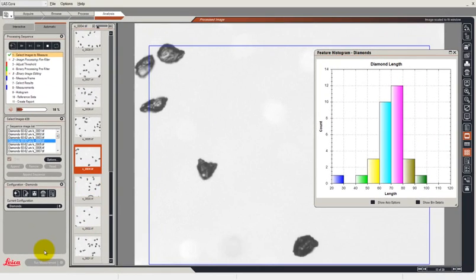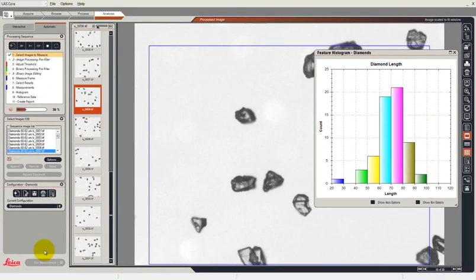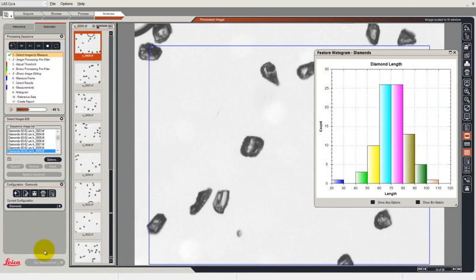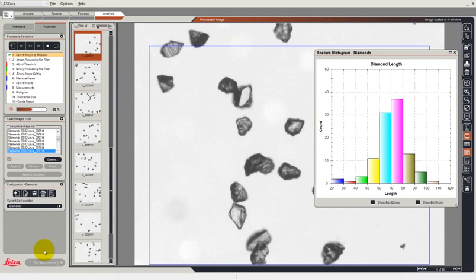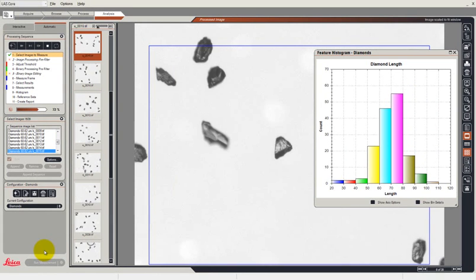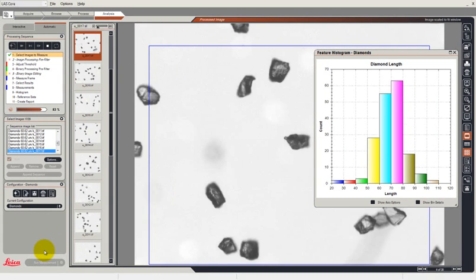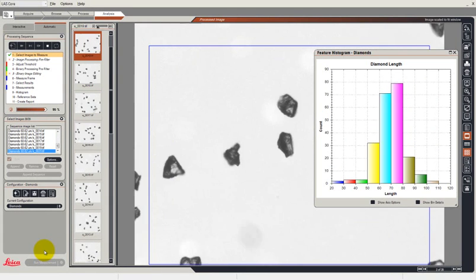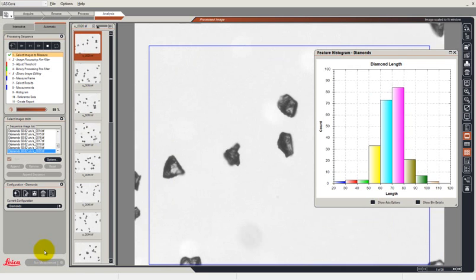And you can now see that the images are being loaded one after another. The measurements are being made, as you can see the histogram is being updated.